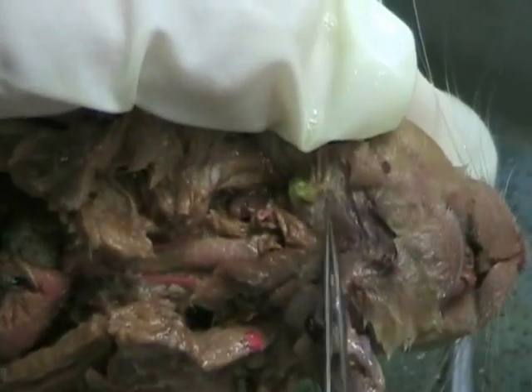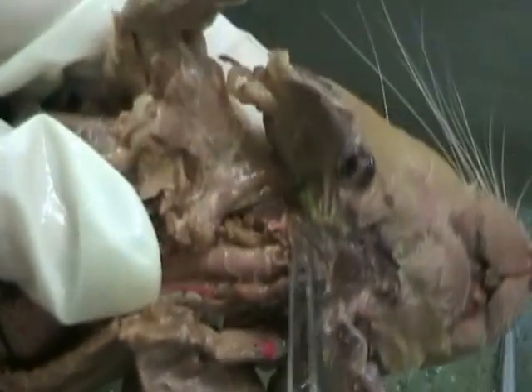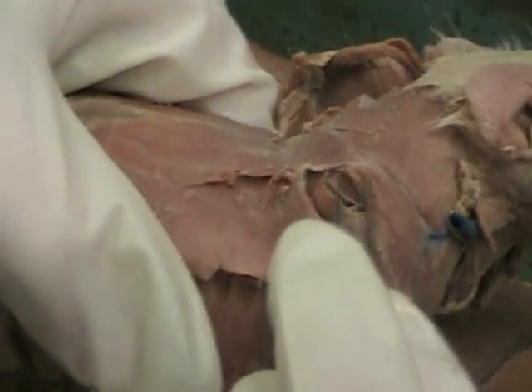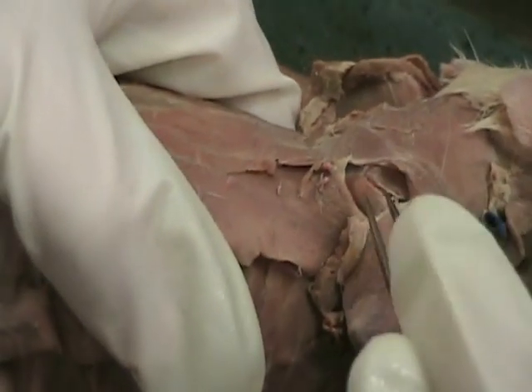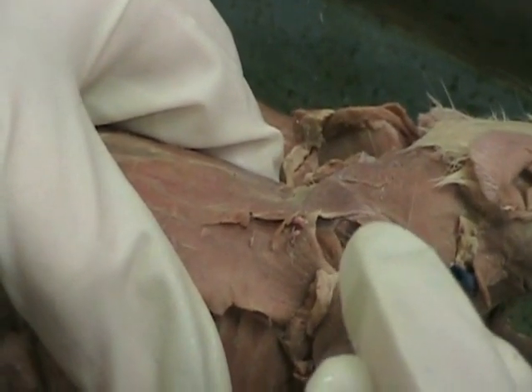Okay. The ones running down the middle, which are kind of underneath these glands, but they're running down the middle and then they split like that, so you can still see the back part of it. Yeah. This is the digastric. Right. Okay. So here's the spinodeltoid, right? And then if we look behind it, we even have to move it up out of the way a little bit. We'll see the infraspinatus and the teres major, right?